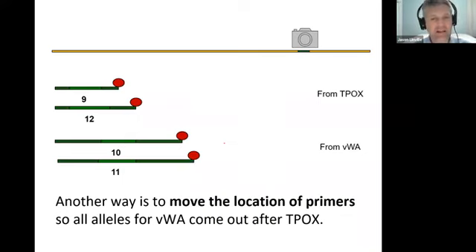But we want to analyze 16, so we need another approach. This second approach is a little bit more difficult to understand, okay? But what I want you guys to focus on, I'm going to rearrange some of my windows here so I can draw, okay? I want you to focus on the fact that, because we haven't really gone over this, these are the repeats right here, okay?